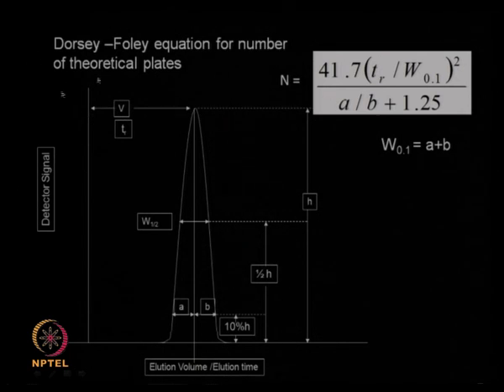This relationship takes care of the differences in the symmetry of the chromatogram that is leaving the column.